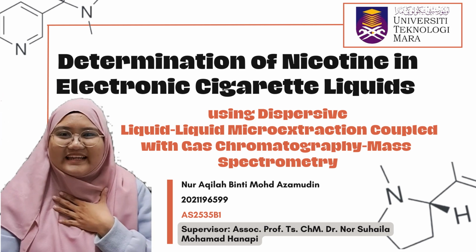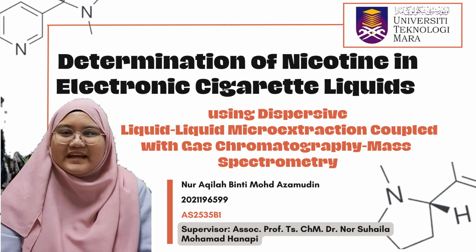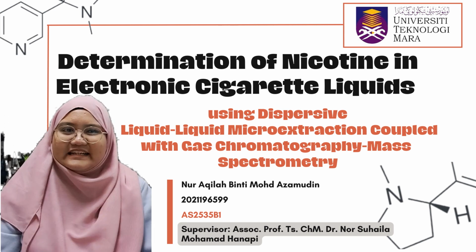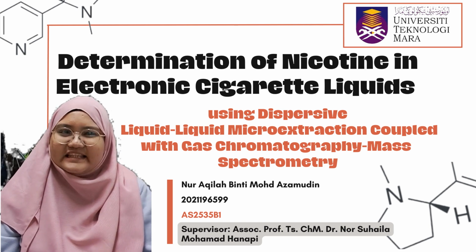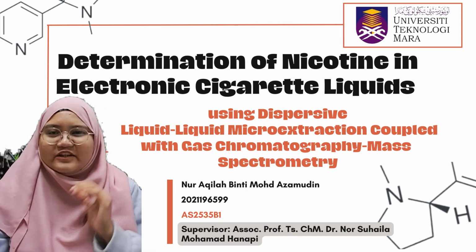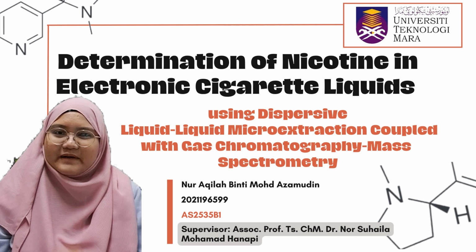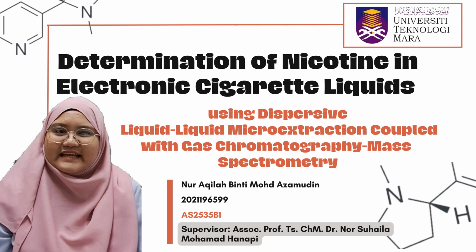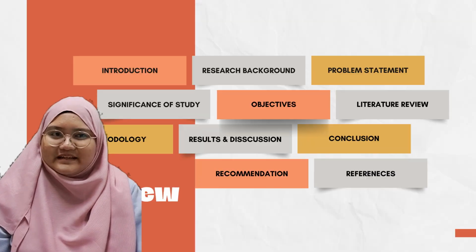I am Nur Akila binti Muhammad Azamuddin from AS253. I would like to present my final project, which is determination of nicotine in electronic cigarette liquids using dispersive liquid-liquid microextraction (DLME) coupled with gas chromatography-mass spectrometry.